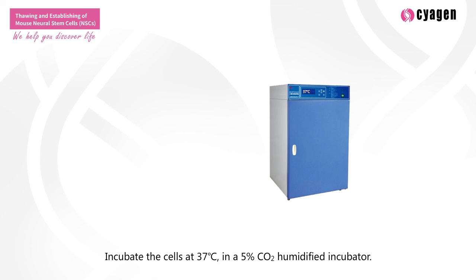Incubate the cells at 37 degrees Celsius in a 5% CO2 humidified incubator. The next day, change spent medium with fresh growth medium.